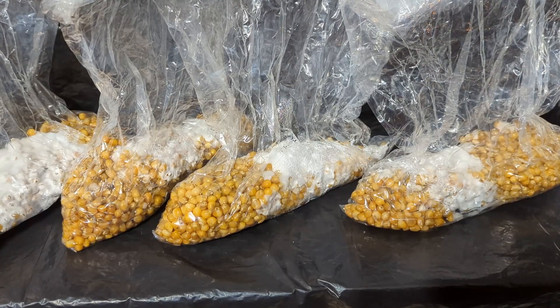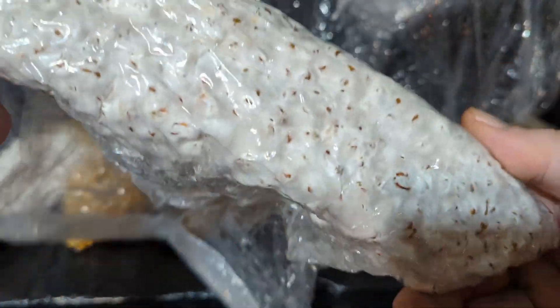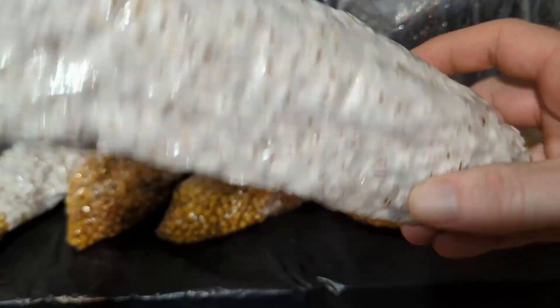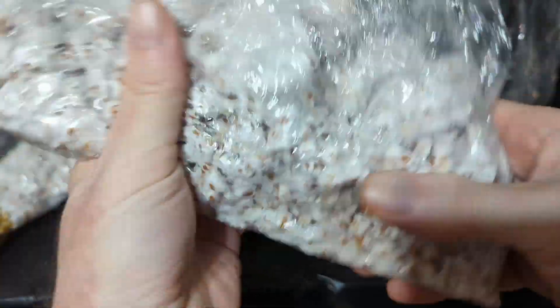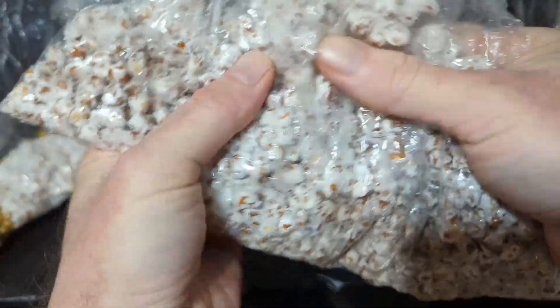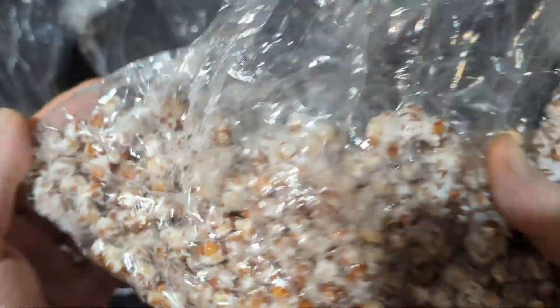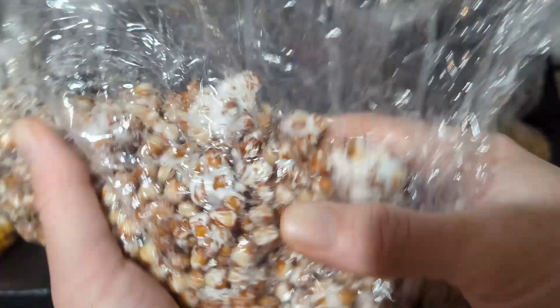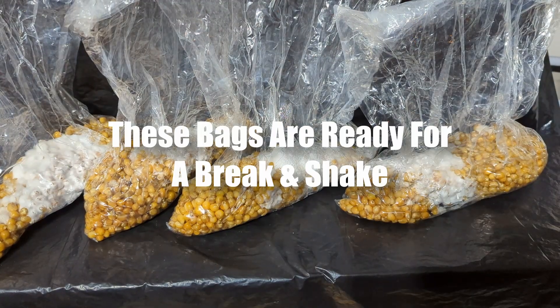I don't try to save or reuse spawn — I'll usually just throw it away and redo it. You should go over everything you did: make sure your grain is hydrated properly, make sure you aren't using too much grain in your container, and make sure you're sterilizing your grain and agar properly. With bags or jars, try not to move them too much because it can disturb the mycelium and set everything back a day or two. Once it gets to about 30% fully colonized, we can do a break and shake.